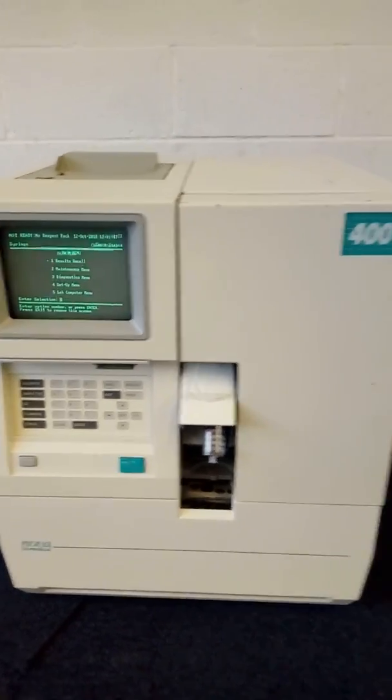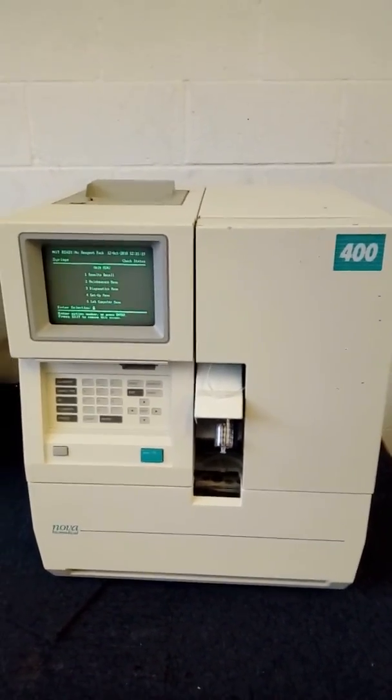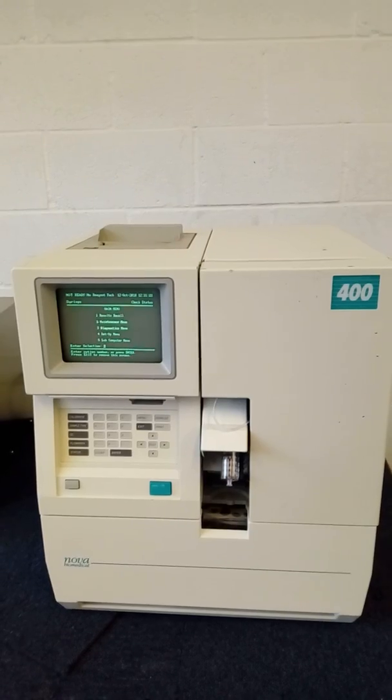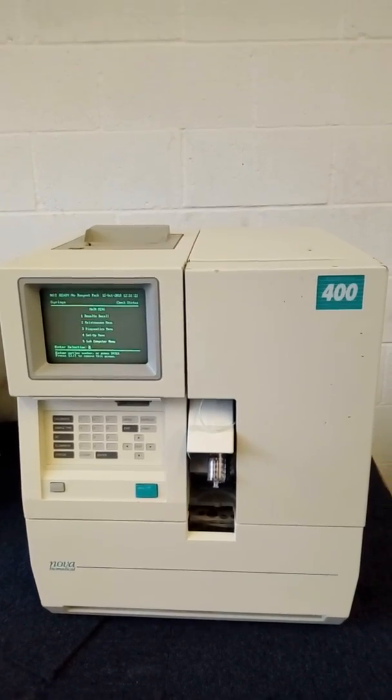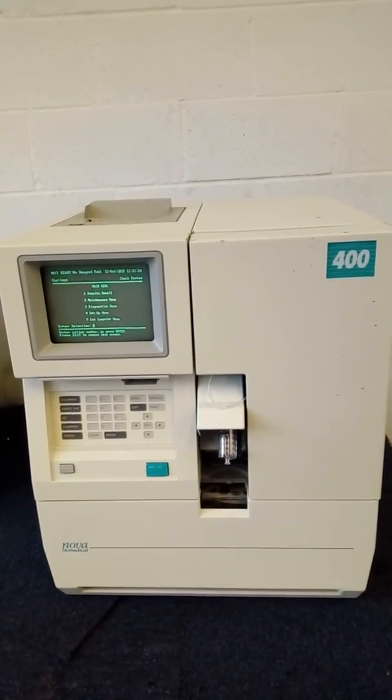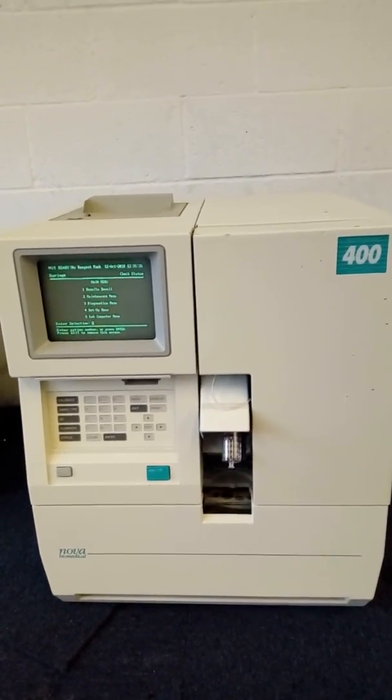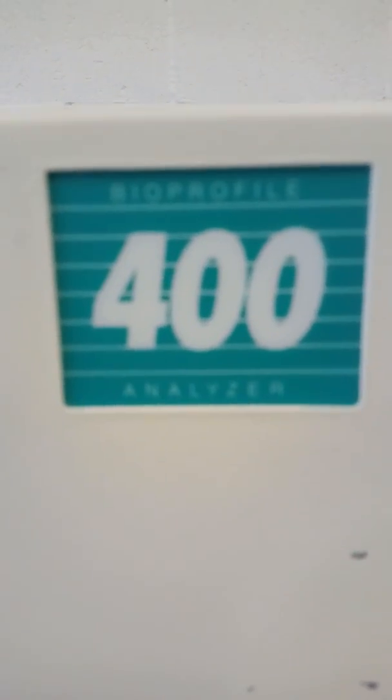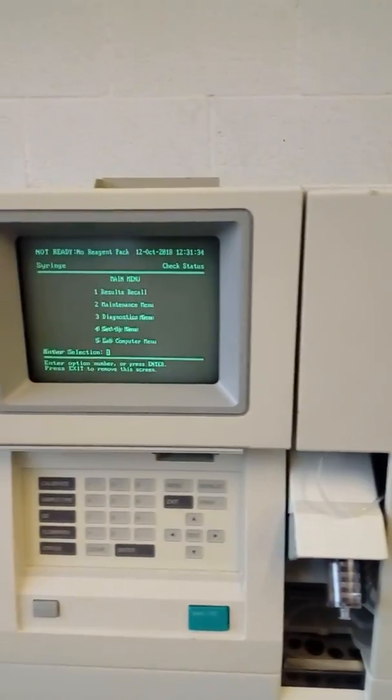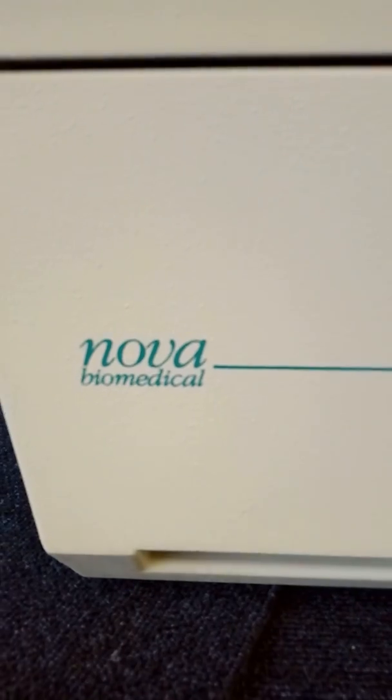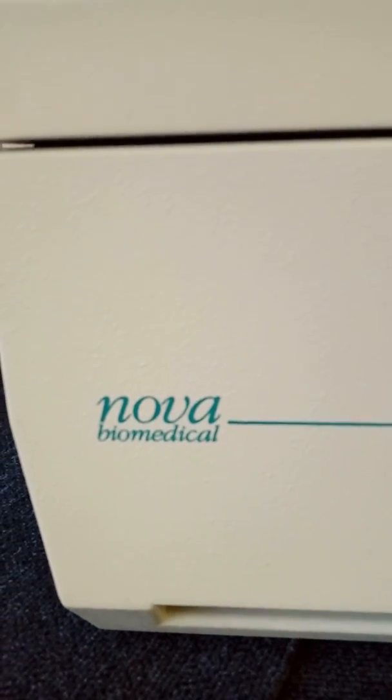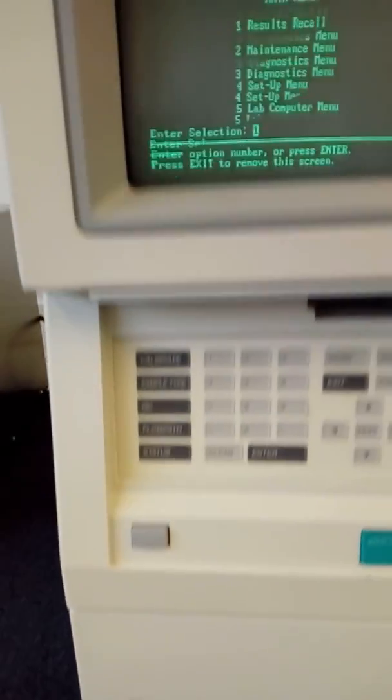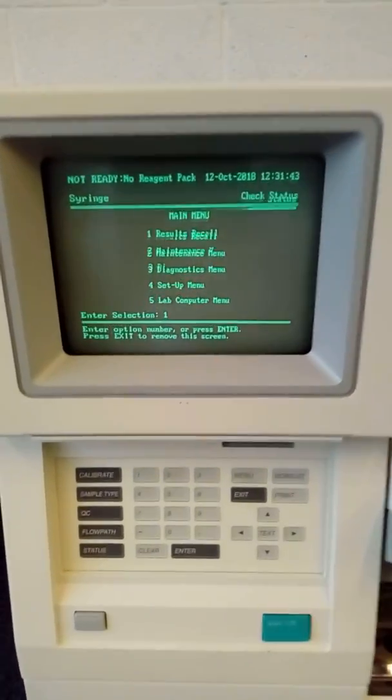This is a test video for the Bioprofile 400 Analyzer Nova Biomedical. This piece of equipment is currently powered on.